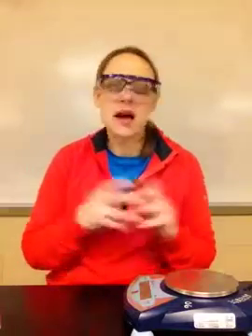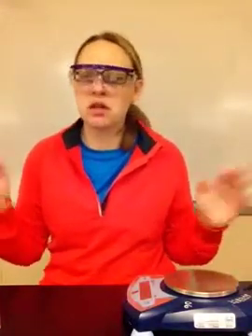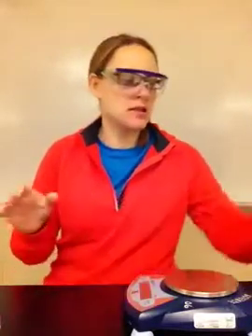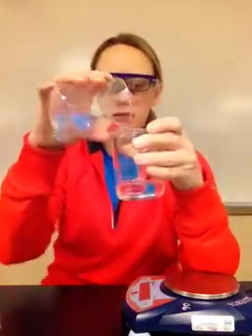Okay? You might be asking, how much distilled water do I need? That is, again, something you need to figure out. Okay? It's up to you. All right? So I already have these 2 dissolved in water. Okay? So now I have my 2 reactants. They're in aqueous solution so that they should react with one another. And I'm just going to mix them together.